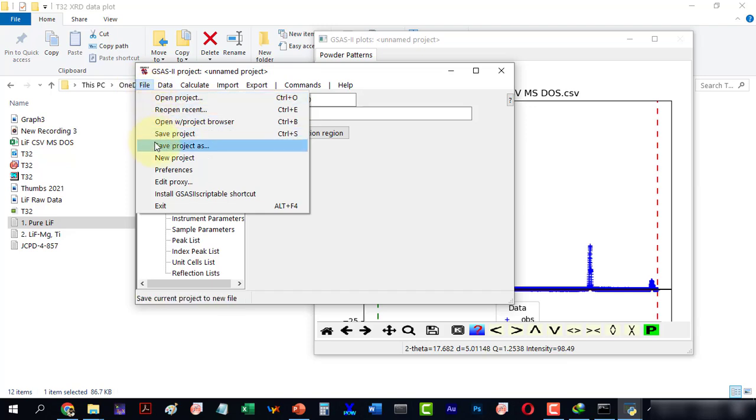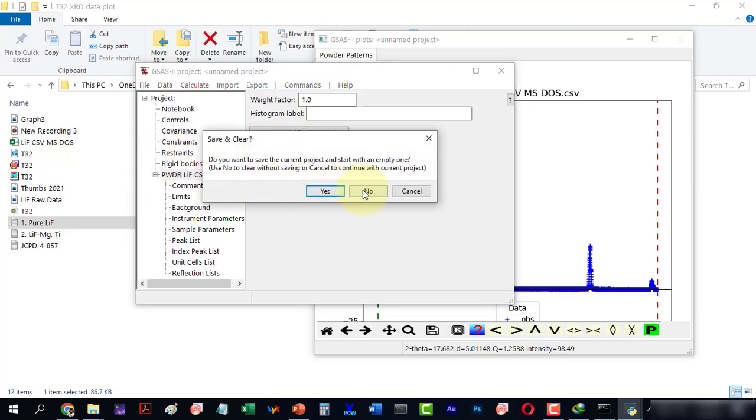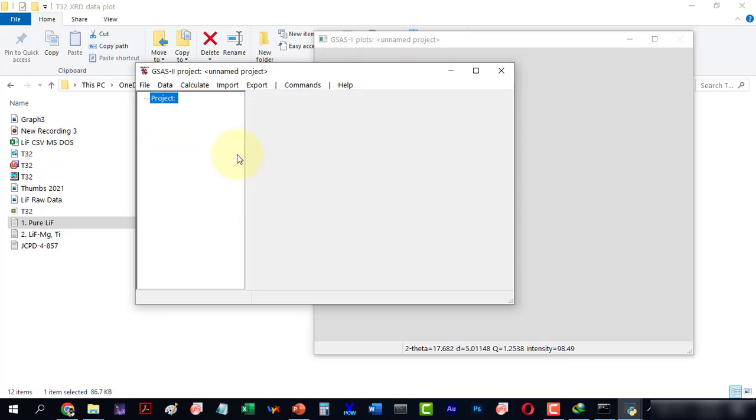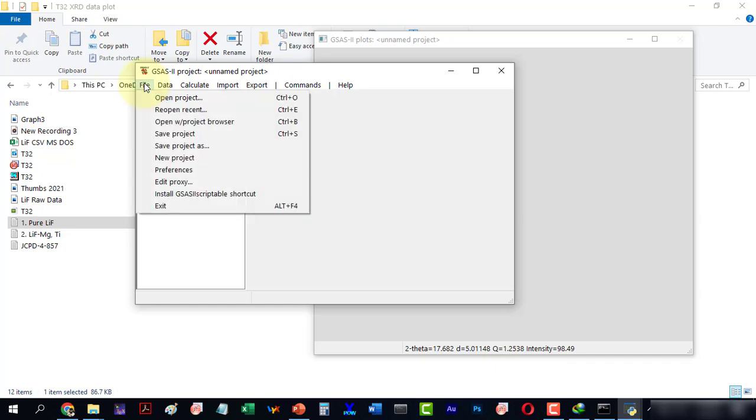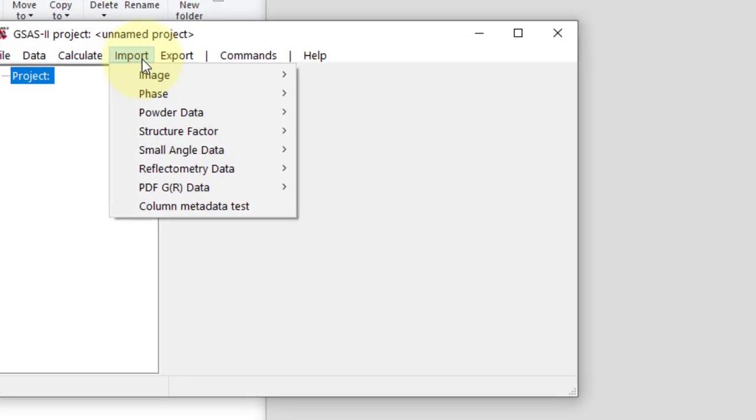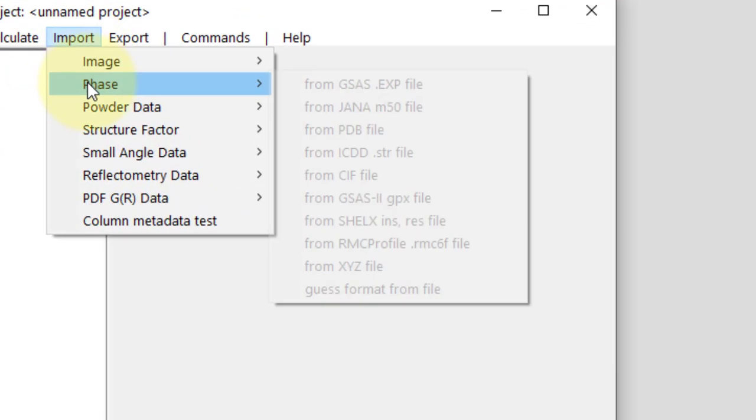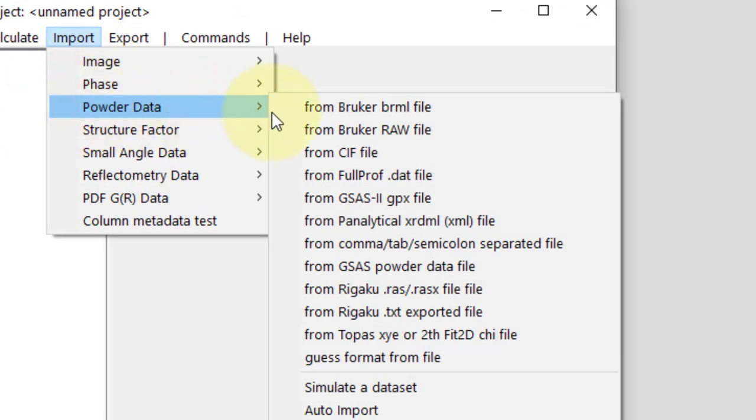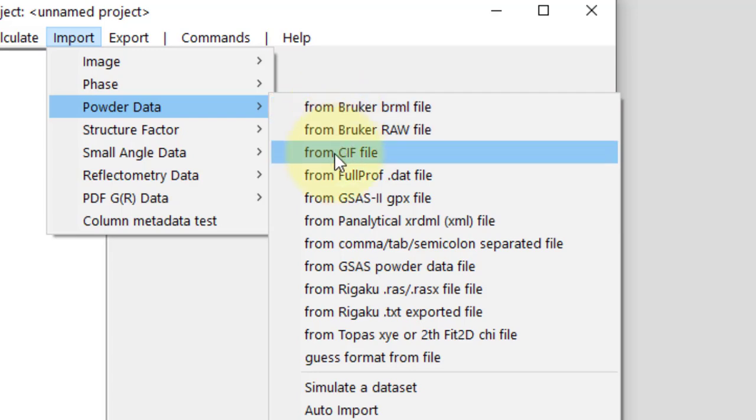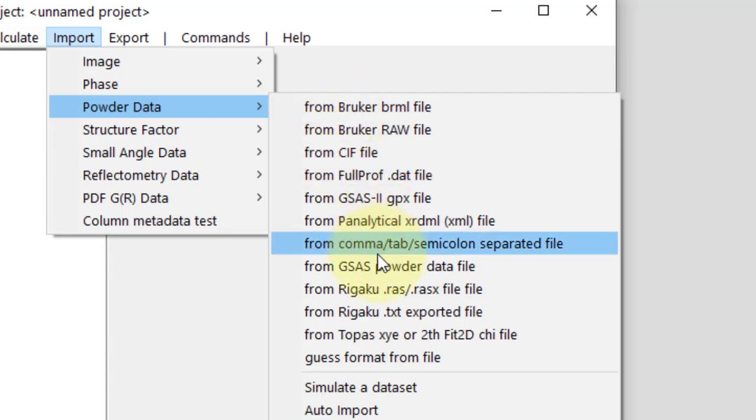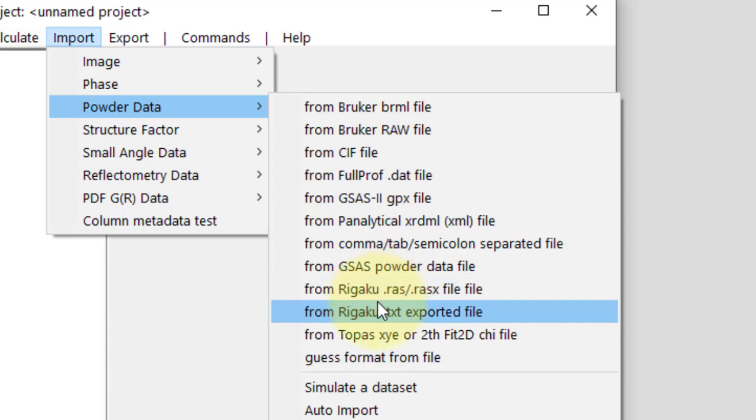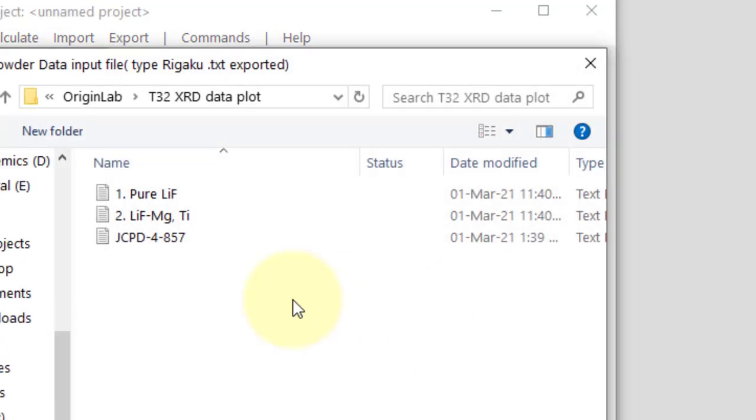GSAS has a rich menu here and we can import powder data with other extensions as well. Let's try the text extension. Open the text file.